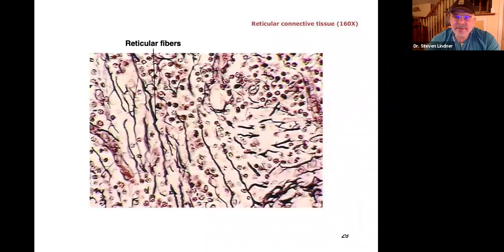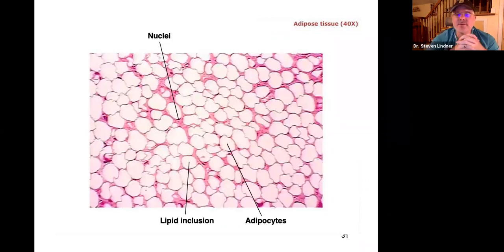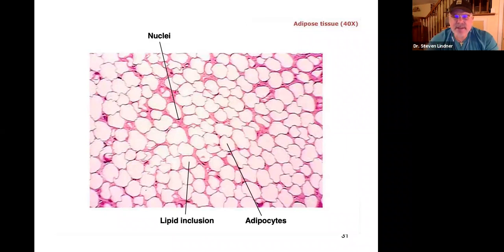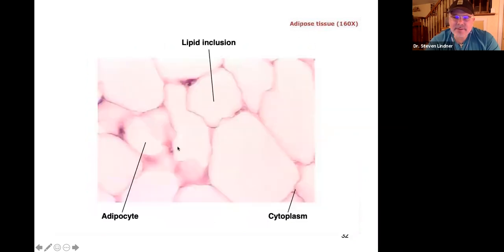This is reticular connective tissue, which helps give organs their shape and contour. Now, students often confuse adipose tissue with squamous cells because the cells look flat and irregular — but remember, squamous cells have centrally located nuclei. In adipose tissue, the nuclei are off to the periphery. There's no centrally located nucleus — these are adipose fat cells.